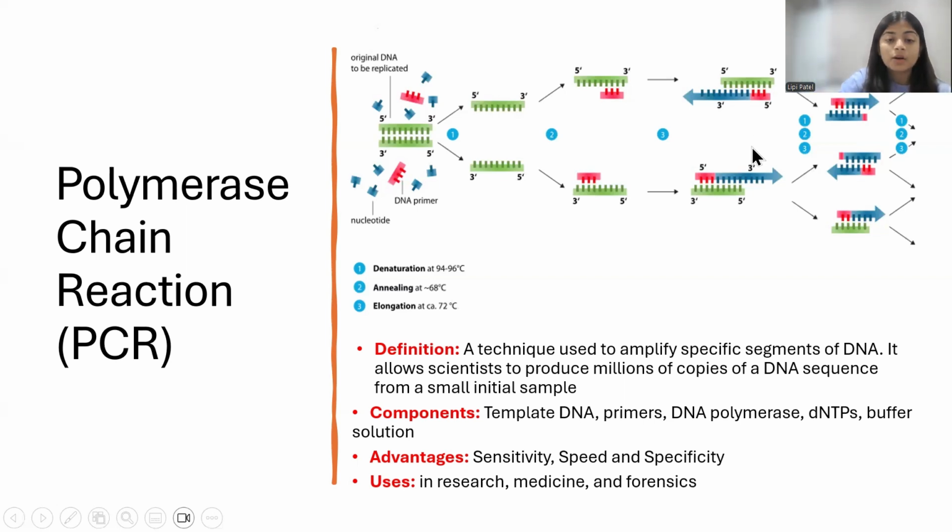And the third step is elongation, where DNA polymerase adds the dNTPs individually to the DNA template in the same direction as they were generated. So this will go from 5' to 3', and this will go from 5' to 3'. The direction of adding the nucleotides is always consistent, 5' to 3', regardless of the green part here. So even if this is 5' to 3', the addition of dNTPs will take place from 5' to 3'. And also over here, it is opposite, right?